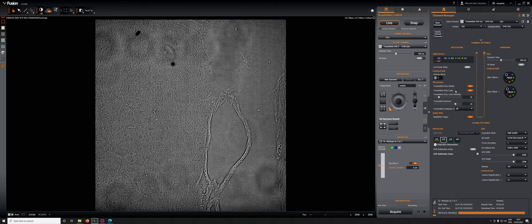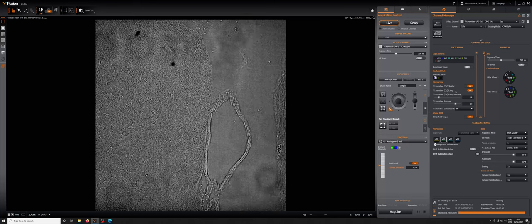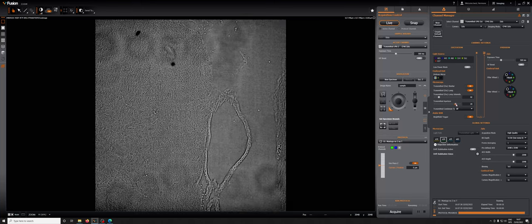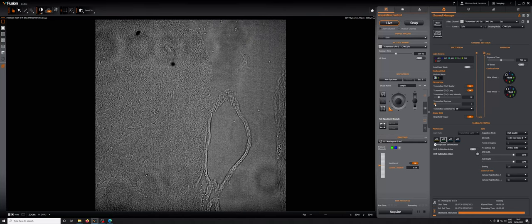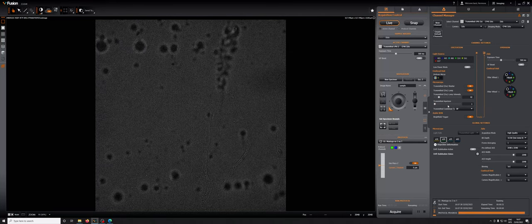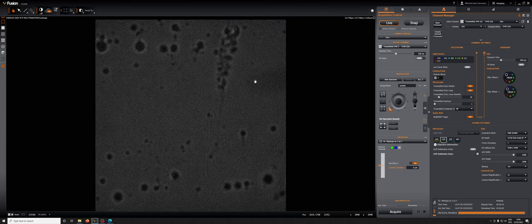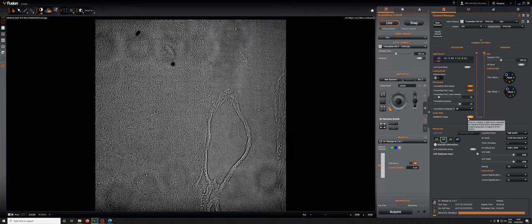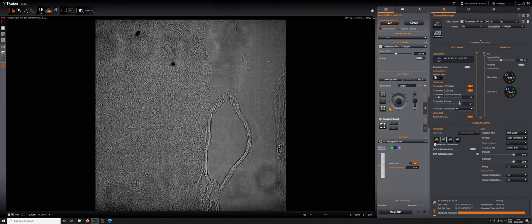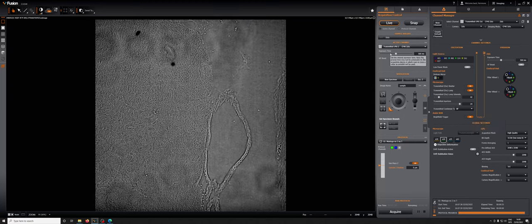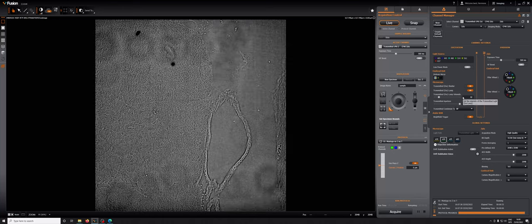For any transmitted light channel to work you need to have the shutter open, the lamp open, and the aperture has to be open at least more than one because else you get all of these artifacts. What I recommend is just increase it until it's fully open and then you have to check what combination of exposure time and lamp intensity gives you reasonable results.